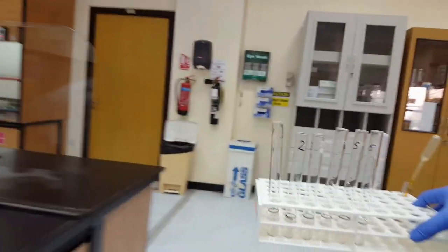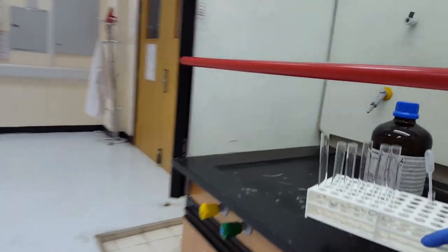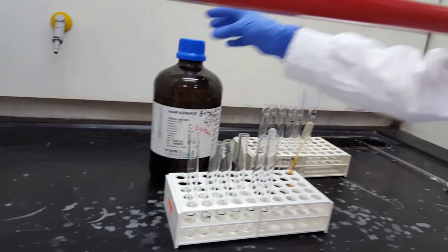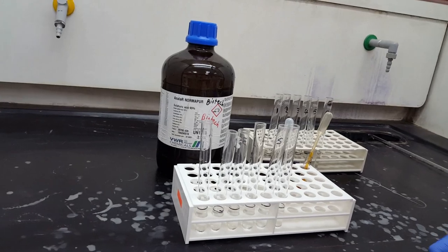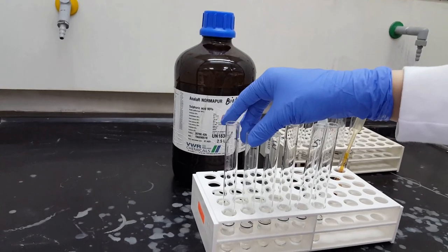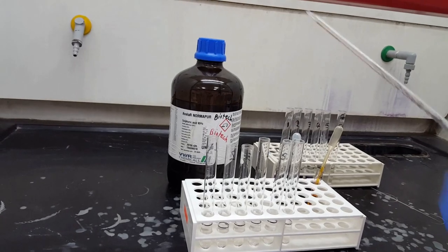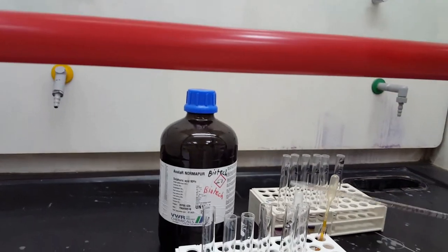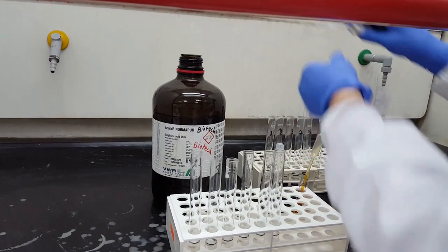So now we are going under the hood. At this step, we have to add the concentrated sulfuric acid. Since it's corrosive, we have to work carefully under the hood. I'm going to add the sulfuric acid to the first two test tubes, and we have an example, so we'll not waste time. We have to use the graduated glass pipette to add the sulfuric acid, and as I said, we have to work carefully.